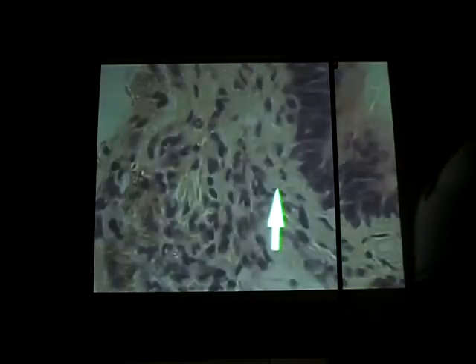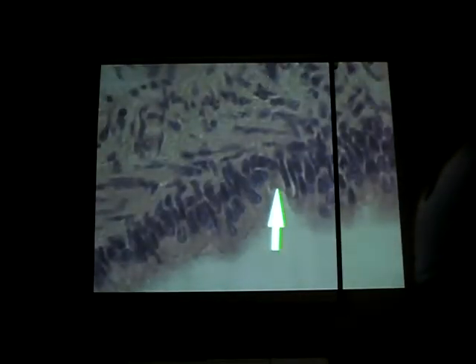So let's look around to see if we see any cartilage. Even though we're not really seeing any cartilage on this one, because it has pseudostratified epithelium, I would say that's still a part of the bronchus. We probably cut through a piece and it missed the cartilage entirely. But usually you will see little pieces of cartilage surrounding it. So I wouldn't show you that one as an example.